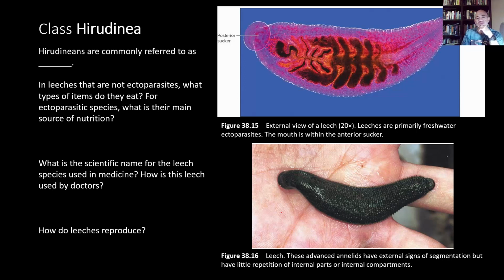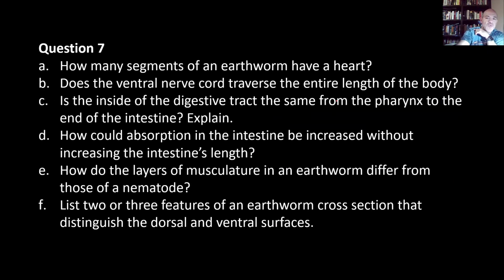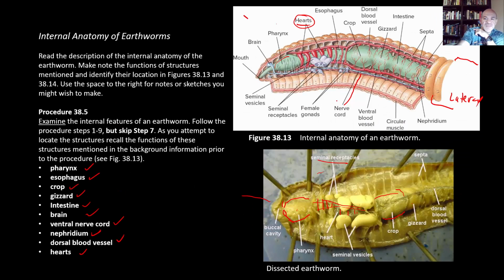There are other features that the Hirudinea have. They don't have internal walls that separate each segment, and that's something that I suppose I didn't mention. When you're dissecting through the animal, you can see the remains of what were divisions within there. There are these membranes that actually wall off every segment, and those divisions are called septa.